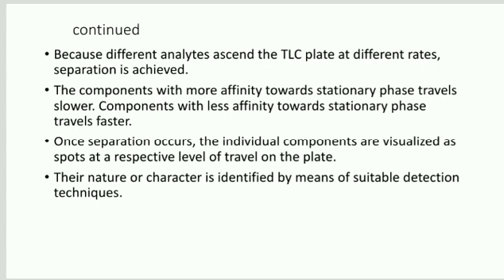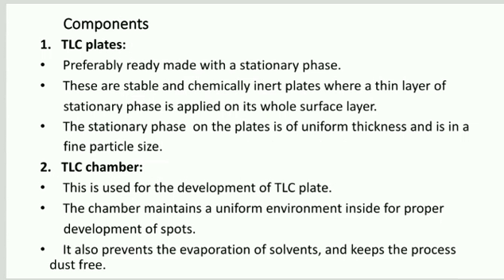Once separation occurs, the individual components are visualized as spots at a respective level of travel on the plate. Their nature or character is identified by means of suitable detection techniques. Components. First one, TLC plates, preferably ready-made with a stationary phase.